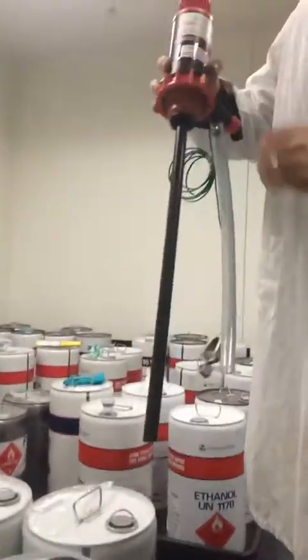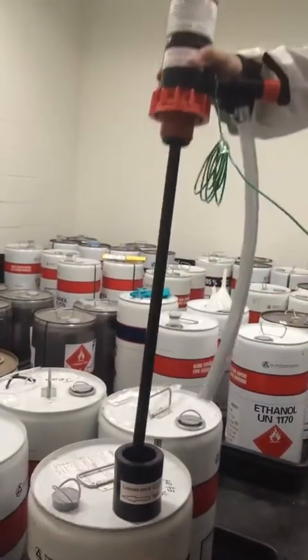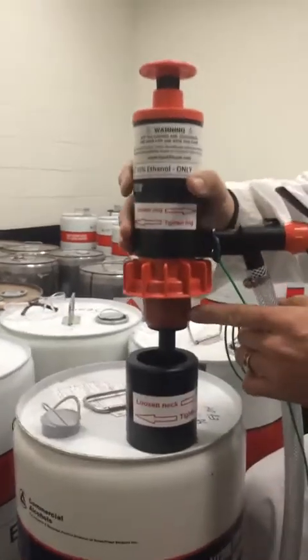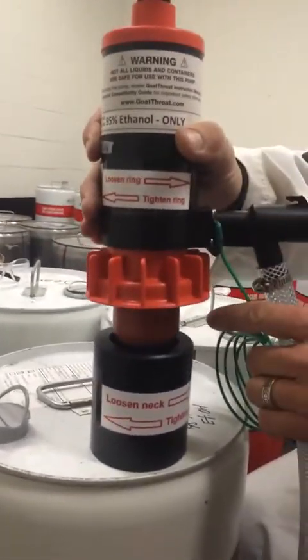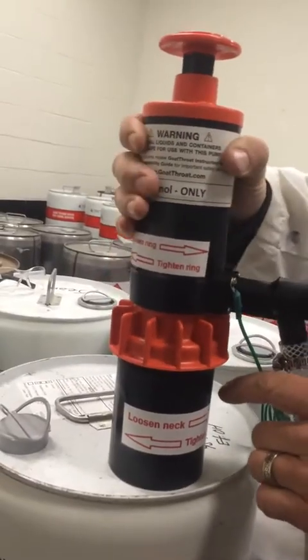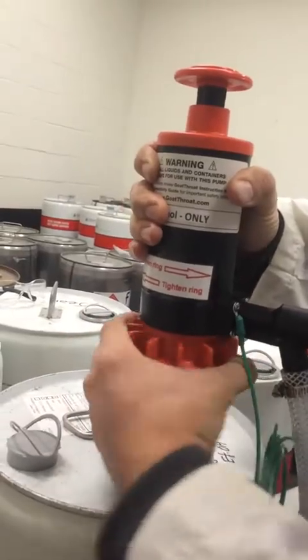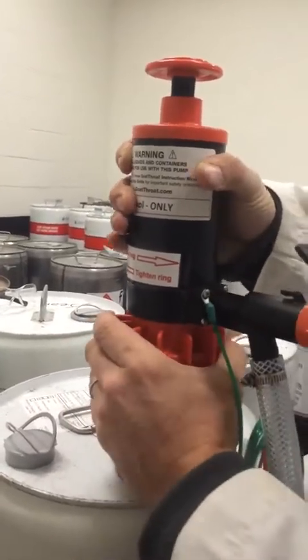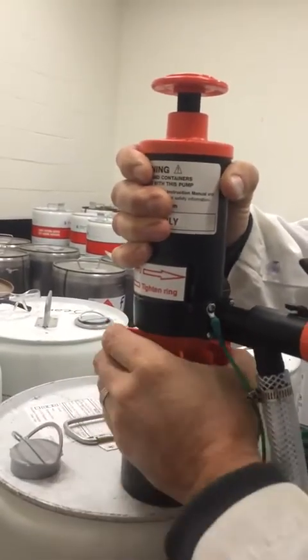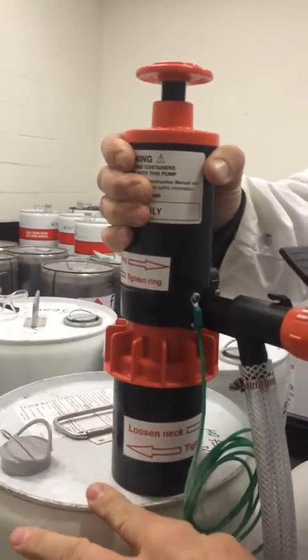Then you proceed to put the pump tube into the drum itself, simply lowering it. You'll notice there's a red rubber flange — that's to sit snugly inside the neck adapter. You hold the pump steady and turn the large dial clockwise — righty tighty. A few rotations, and that expands the flange until the pump is secure.